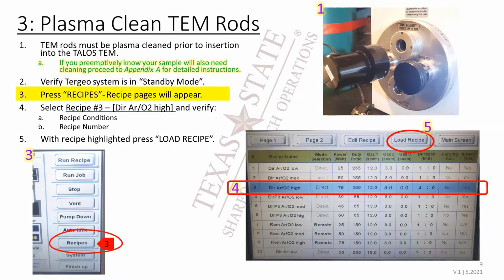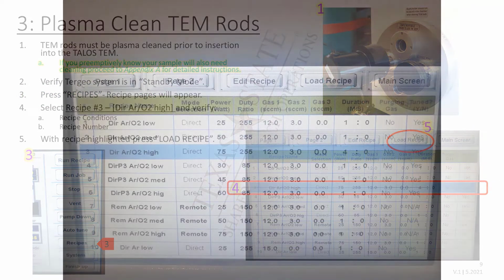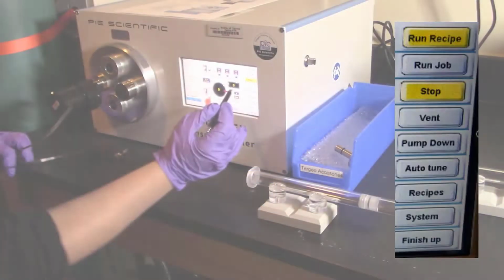Press the recipes button and the recipe pages will appear. Select recipe number 3 and verify the recipe conditions and the recipe number. With the recipe set highlighted, press Load Recipe. Back on the main screen, verify that recipe number 3 has been loaded. Adjust the recipe time if desired, but default is set to 4 minutes.